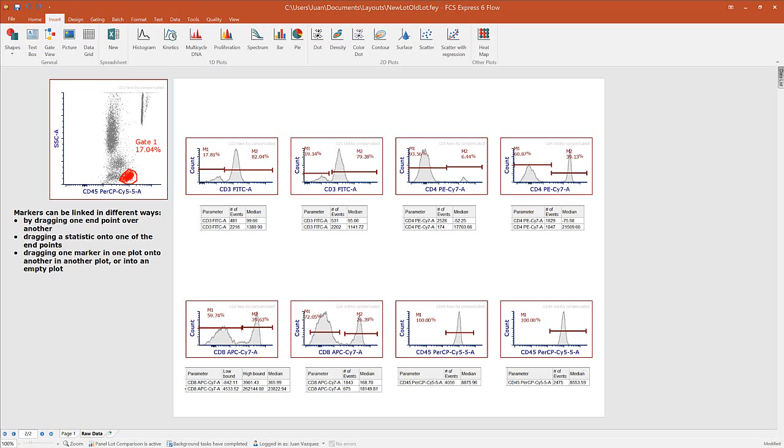What I'd also like to show you now is another new feature that we have in FCS Express called our Standard Operating Procedure Builder. What our Standard Operating Procedure Builder is, it allows us to create a template where we can build instructions into that template. Each of those instructions can be as detailed as you want them to be, but they can also have conditions and criteria as part of those instructions that would prevent a user from going on to the next step of the SOP until the conditions for the previous step have been met.